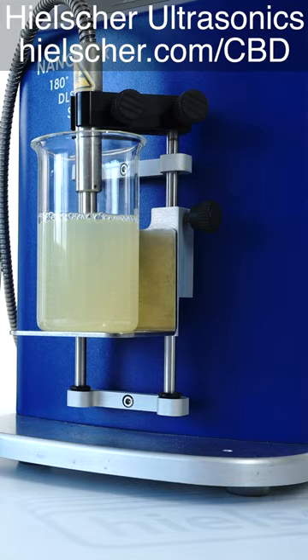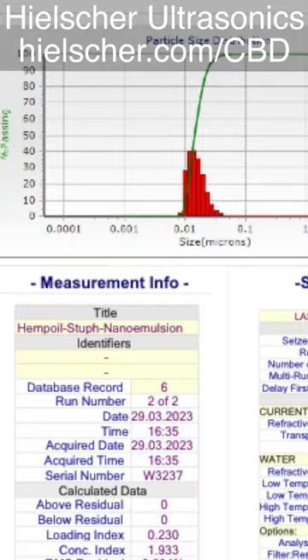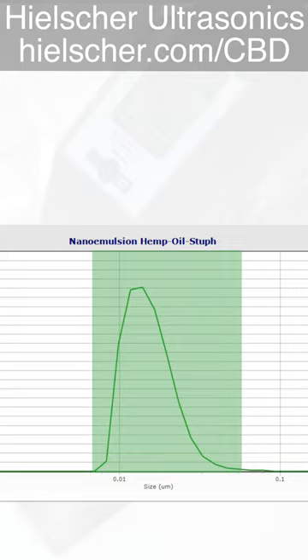We use a NanoFlex particle-size measurement system. The measurement results show a very narrow particle-size distribution in the range from 9 to 40 nanometers. 95% of all particles are below 28 nanometers.